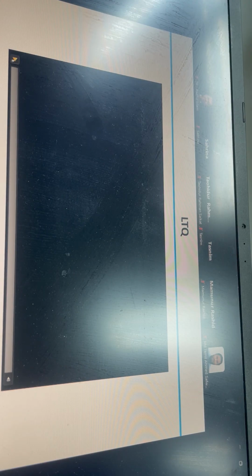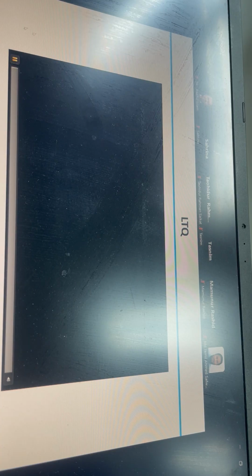Now I would like to show you how the LTQ works, because I'm personally connected with this machine, since it was made by my supervisor. I would like to show how the LTQ works, and you can see how the trap and the detector work, how ions are transferred, how ions are generated. Some of you asked me questions about that, but I stopped you at that time, otherwise I could not finish the lecture. It takes so much time. So let's see this one.